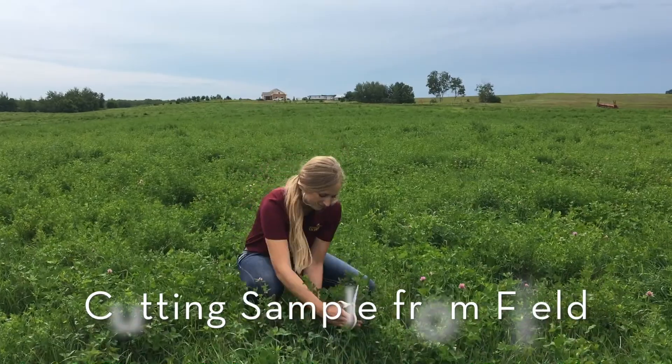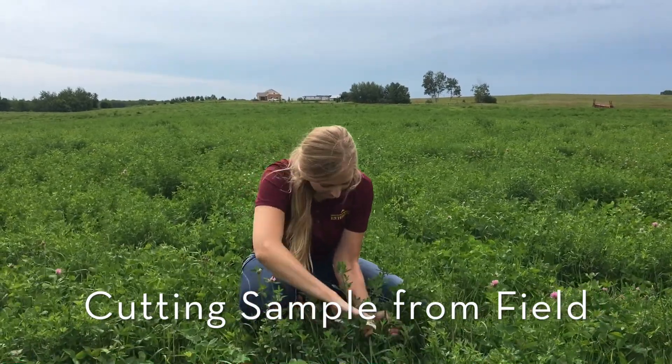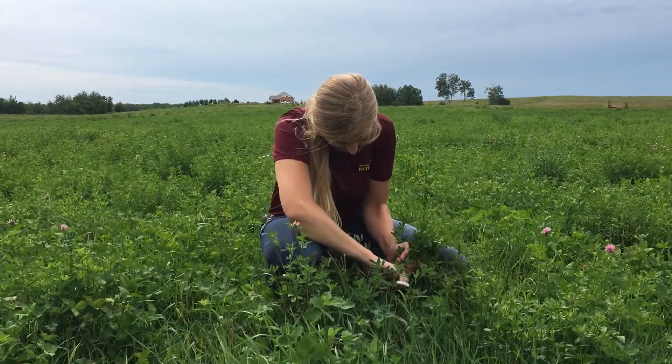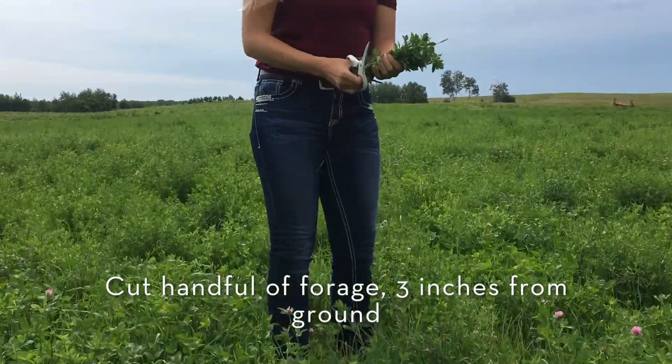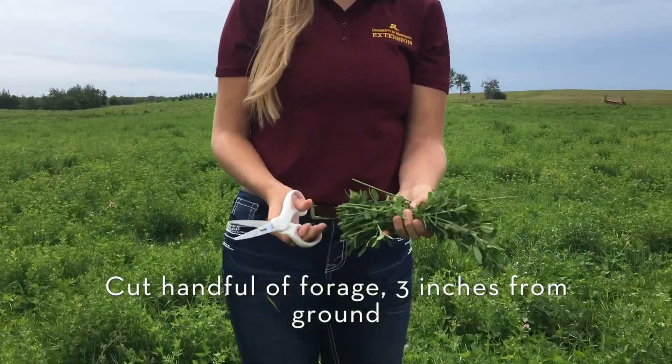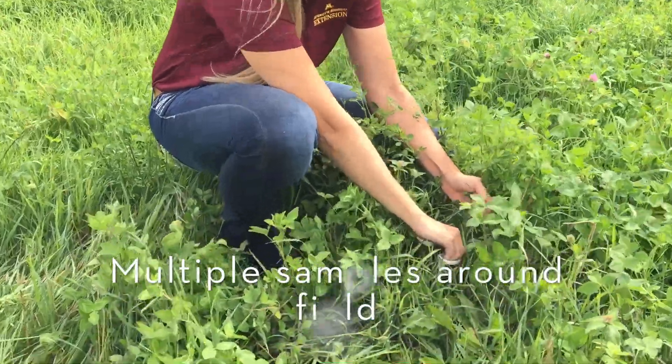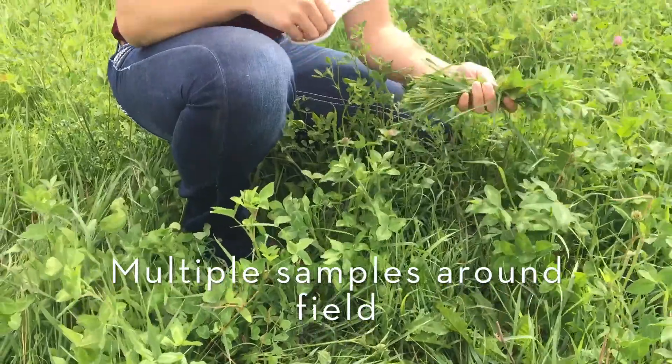You can also take a forage analysis from your growing forages by cutting a sample from your field. You will need a sharp scissors to do this. Take and cut a handful of forages at the length you would normally cut them for baling, which is about 3 inches from the ground. Take samples from different areas of your field to maintain that representative sample.